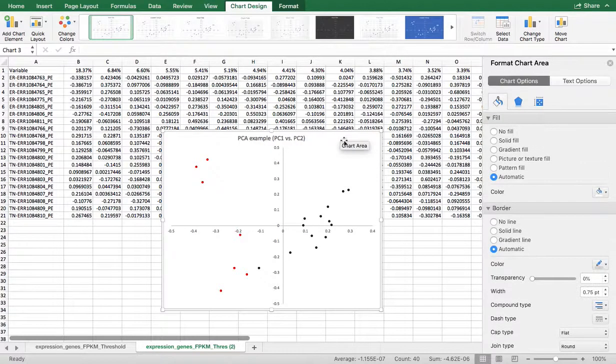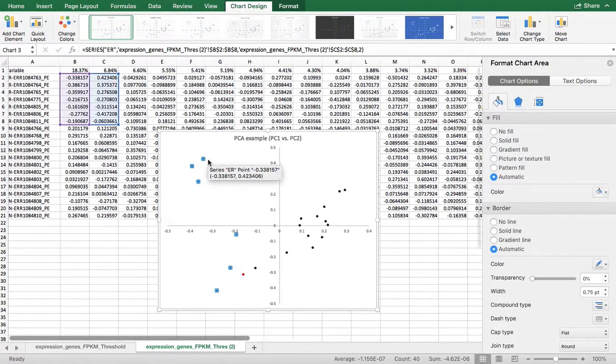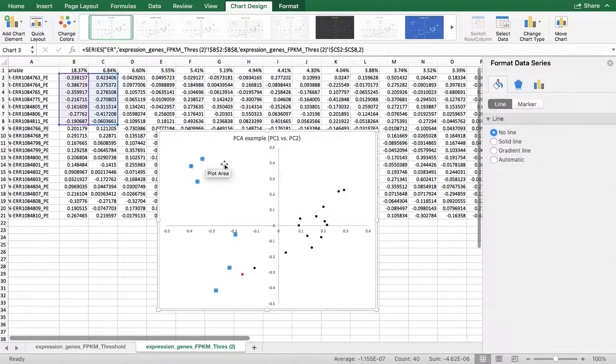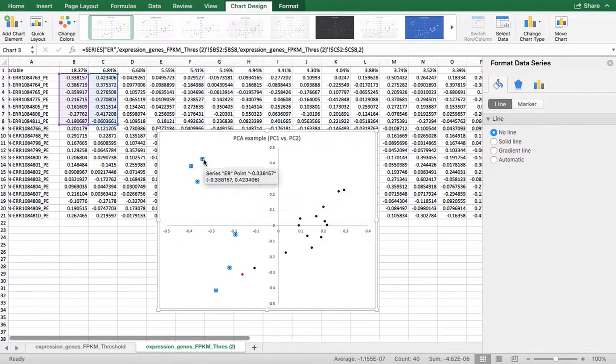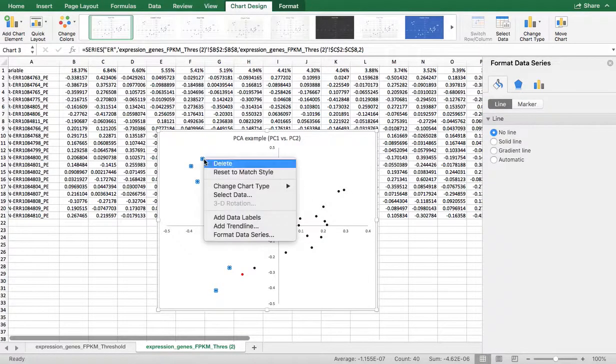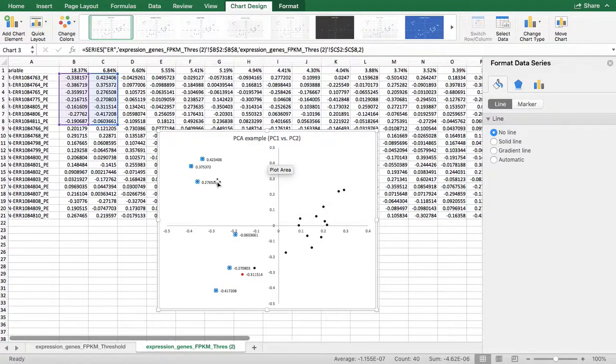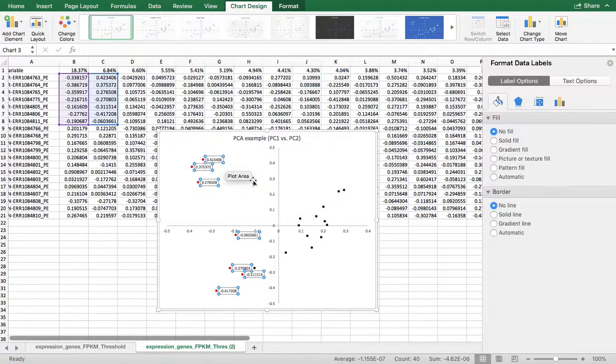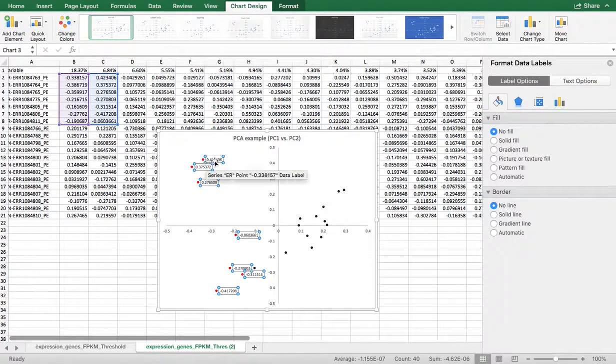Another thing that you can do is you can label these things. How do you label these things? If you're really interested, you can go and right click and add data labels. Now these data labels don't tell you anything.